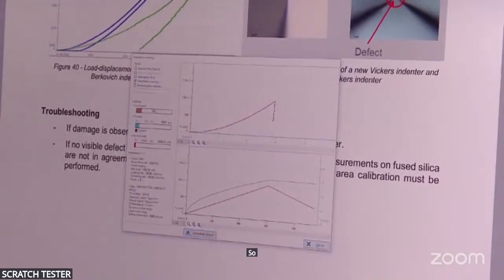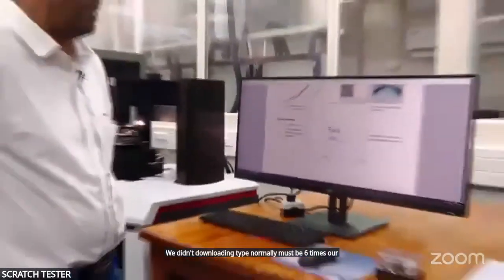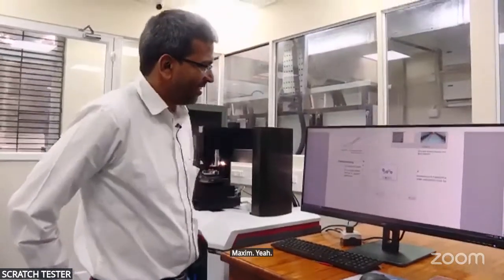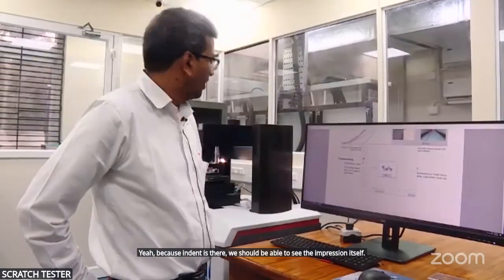So let's say cancel. Because the unloading rate normally must be 6 times the maximum load. So I selected a very low value for this. Yeah, it's okay, I think. Because the indent is there, we should be able to see the impression itself clearly.